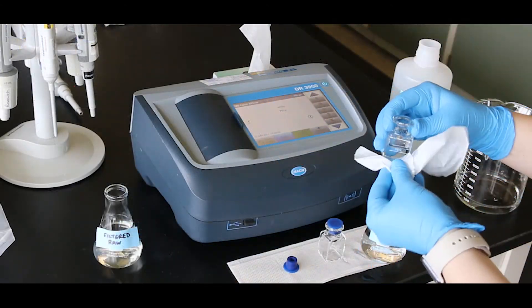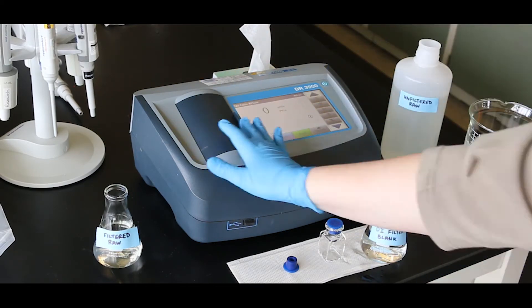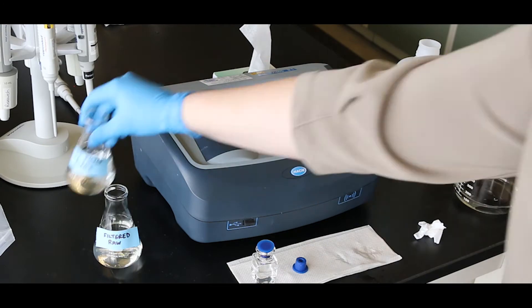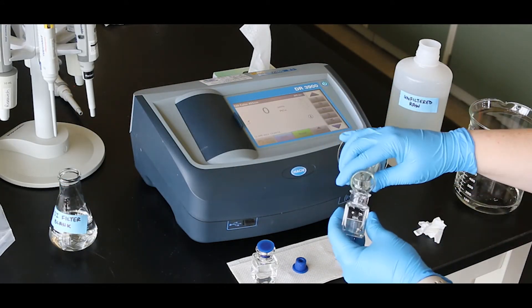For low range color, under 15 platinum cobalt units, use the same cell to zero the blank and read the prepared sample. Make sure the cell is rinsed well and conditioned with the sample.